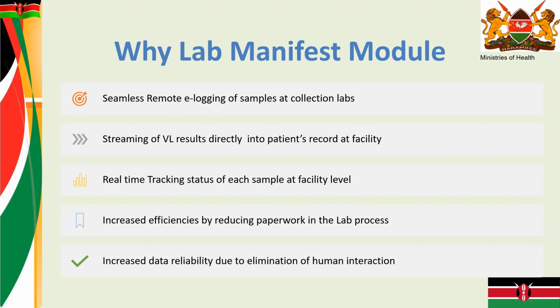So this module ensures that there is consistency between the result that was posted at the testing lab and the result that we receive at the facility level.